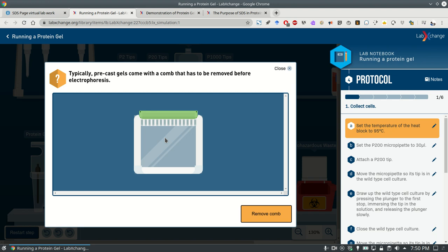There are 2 reasons why you do that. The first reason is when you fill the gel cassette with the running buffer, you soak the gel with buffer. And that's good for the gel because if there's any dry spot in here or some air bubble, you want to know. And you want to also prevent any dry spots from occurring. And so this thing has to be soaking in buffer.